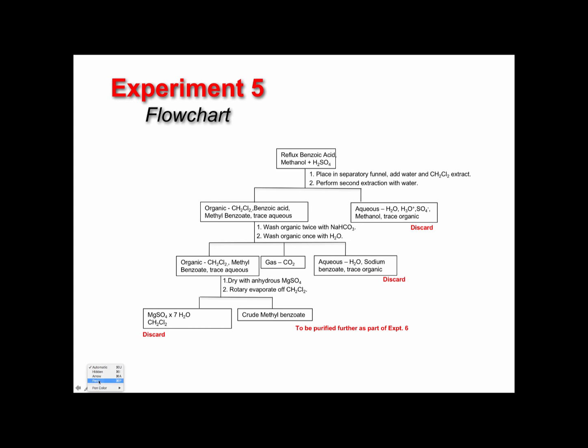Let me convert back into a pen. We'll do this reflux. And at the end of it, you're going to take that reaction mixture and transfer it to a separatory funnel. And you're going to do some extractions. You're going to add water and do an extraction. And then you're going to perform some other extractions. You'll extract again with water.